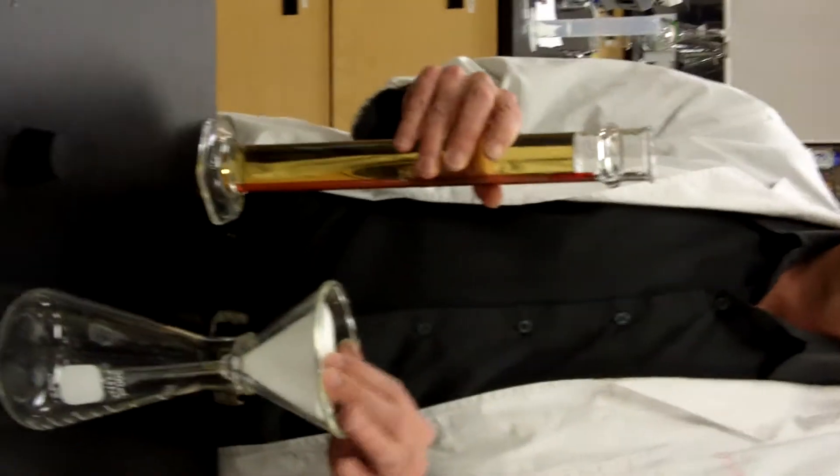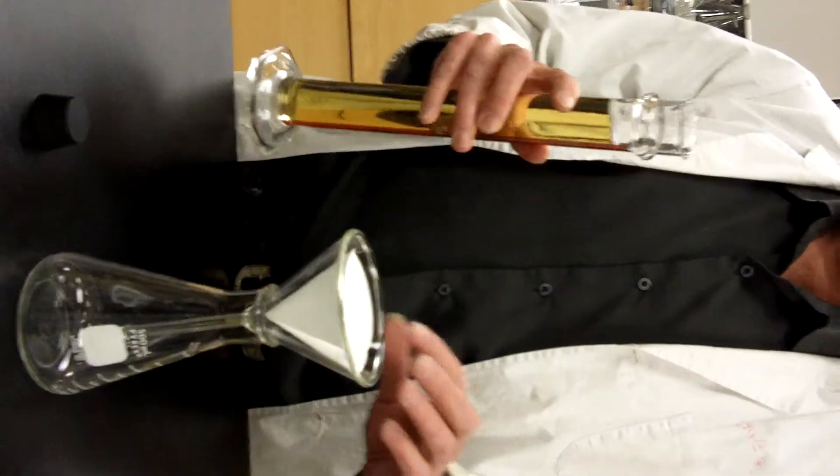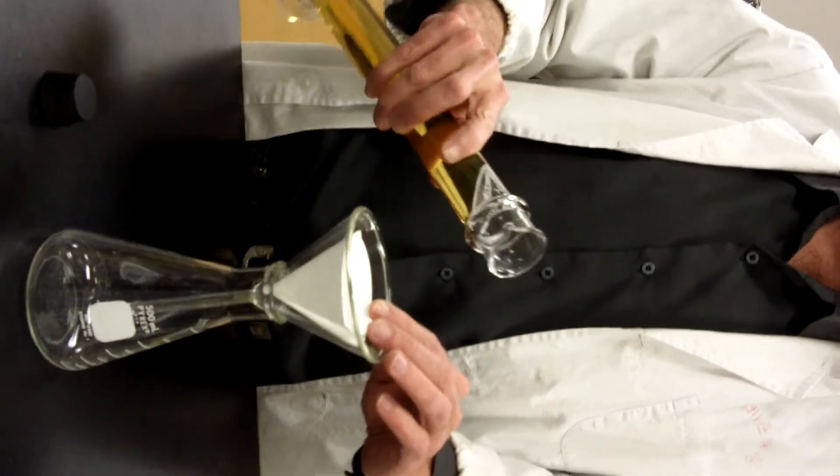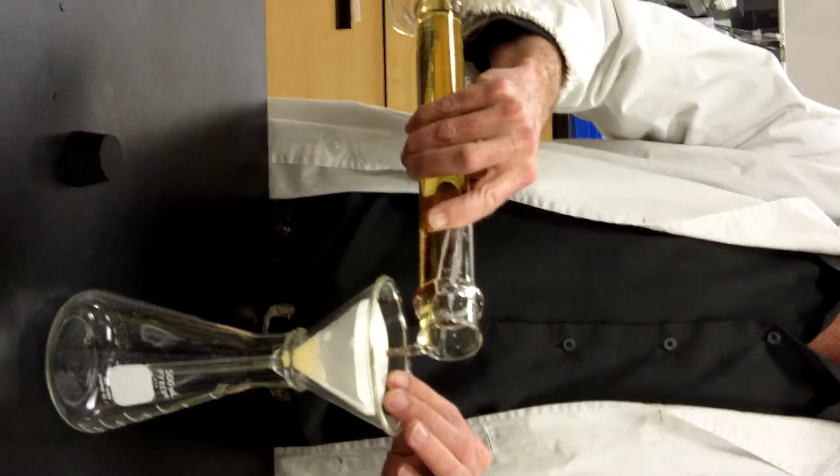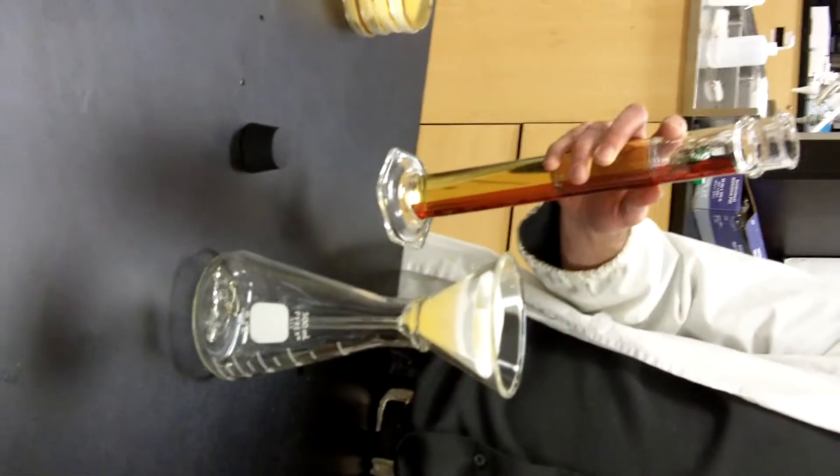Then what we're going to do is do further analysis, which is going to be the color, bitterness, and diacetyl. So what we have to do first is filter the beer on the filter paper. So you just pour it down, and you've got to be patient because it does take some time to go through the filter paper.